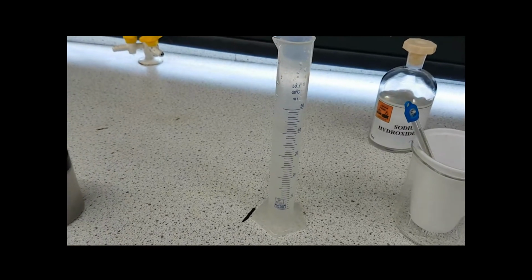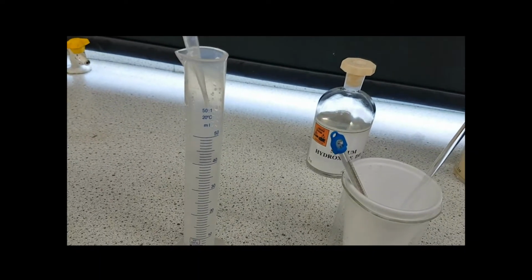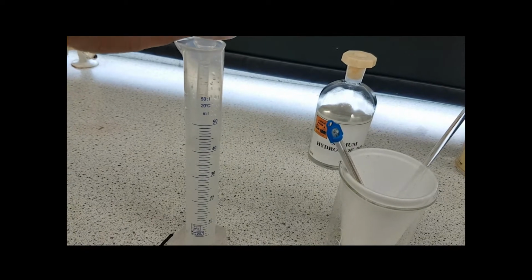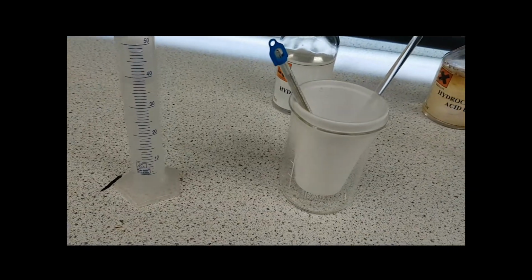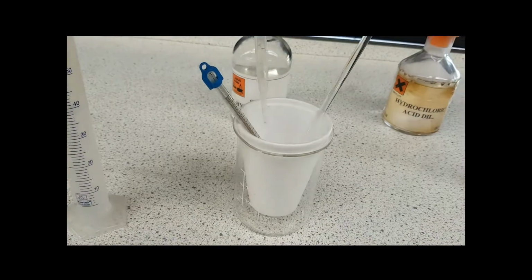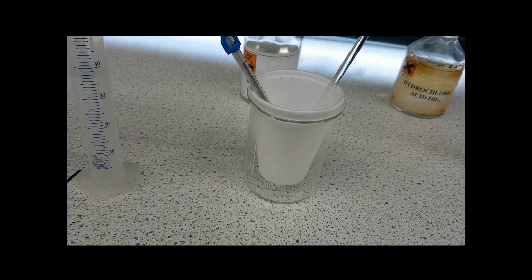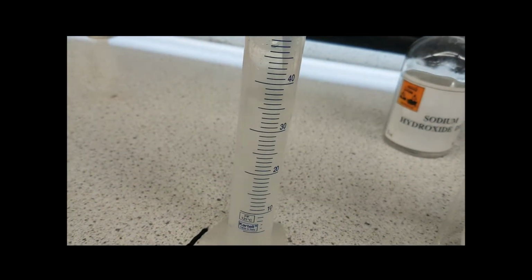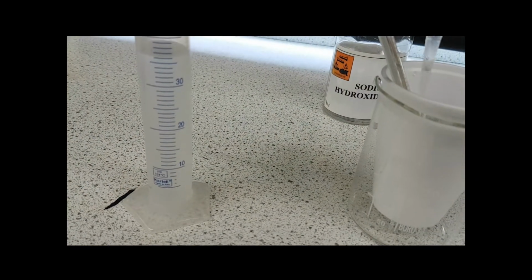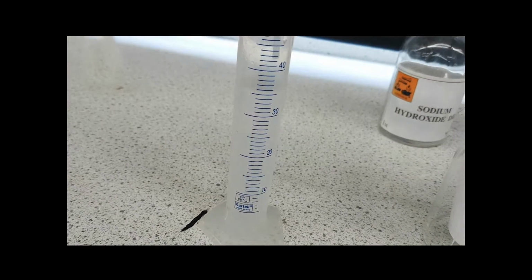So here's my sodium hydroxide solution. I'm going to add 5 milliliters in. I'm going to use my pipette to do that. The pipette goes to a maximum of 3 mils, and as you can see, it's gone down by 3 mils. So you're going to have to put in 3 mils and then get 2 more. You're going to have to be careful and look at the eye line and just stop squeezing until you've got your 5 mil. So that's my 5 mils.